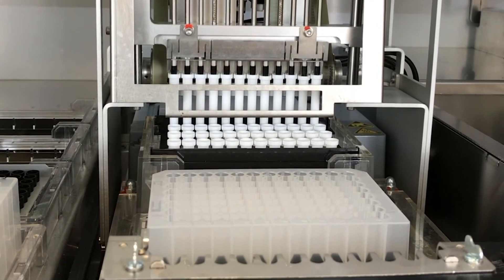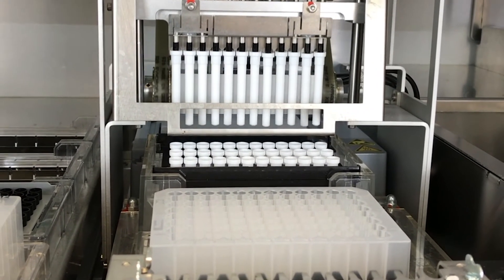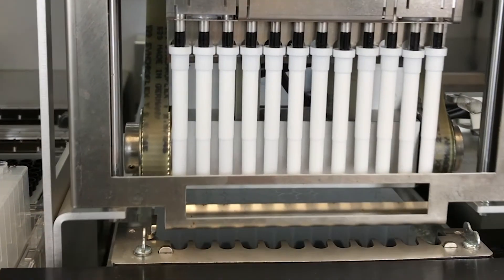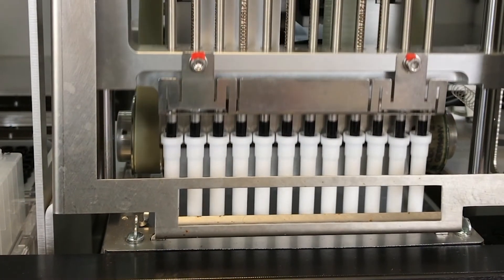The magnetic separation head has 12 rods which can be magnetized and demagnetized. Magnetic rods are covered by disposable sheets.